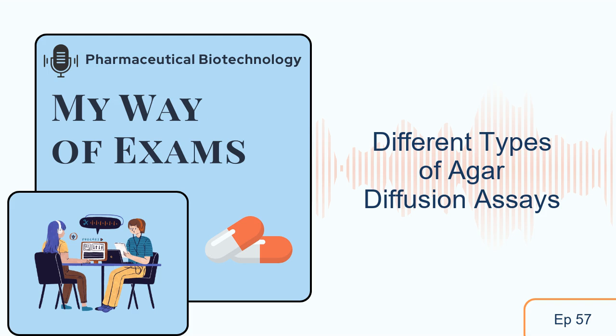So let's recap what we've learned. We've got well diffusion for testing out liquids, agar plug diffusion for seeing those secreted antimicrobials, the spot assay for a quick screening of a bunch of samples, and the cross-streaking method for observing those microbial interactions. It's clear that these agar diffusion assays give scientists a whole toolbox for tackling questions about antimicrobial activity.